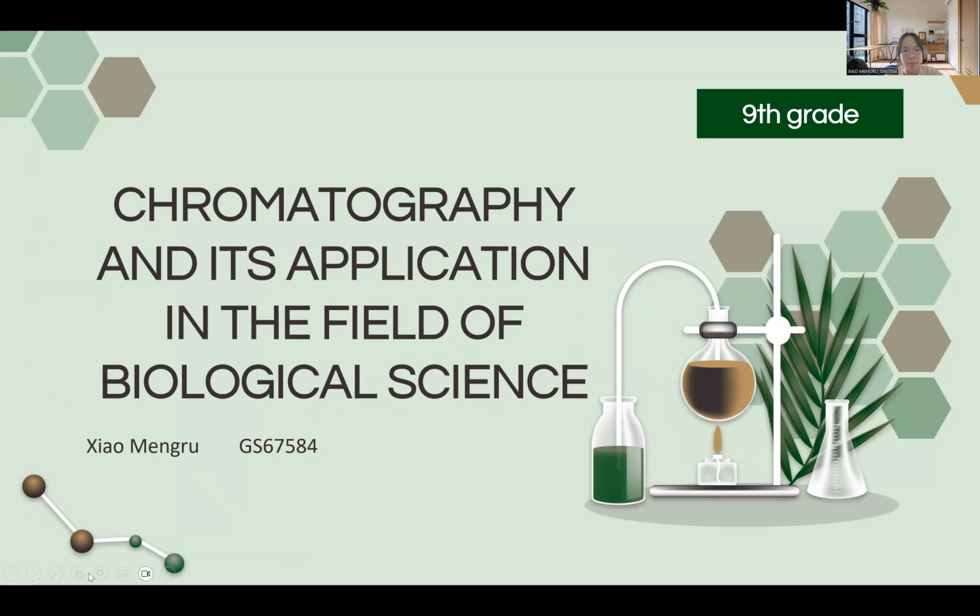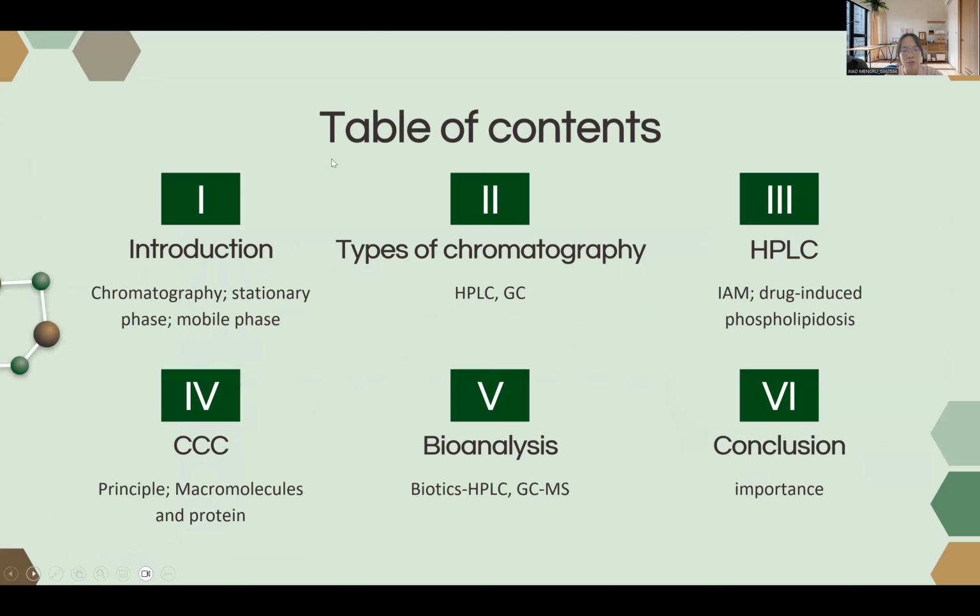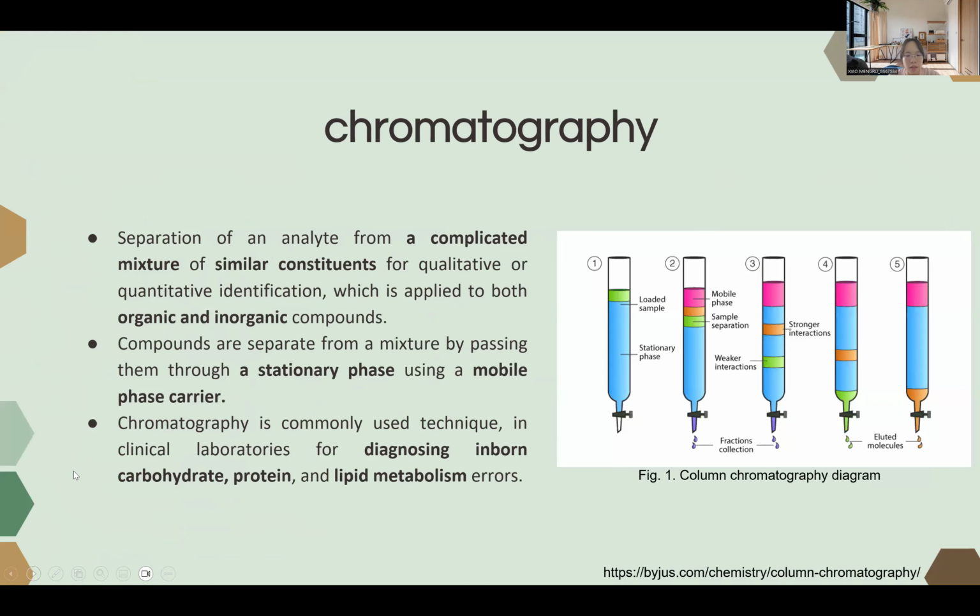I will introduce three parts: an introduction to chromatography, types of chromatography (HPLC, CCC, and GC), and their biological applications in bioanalysis, followed by a conclusion. Firstly, I will introduce chromatography.